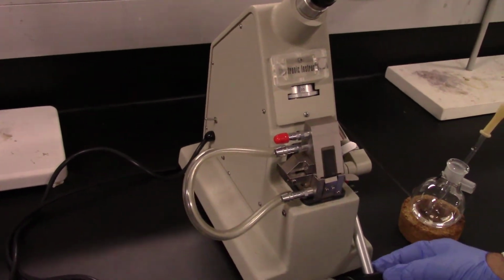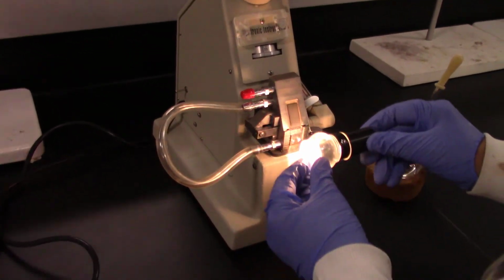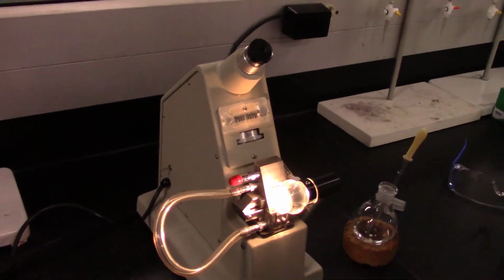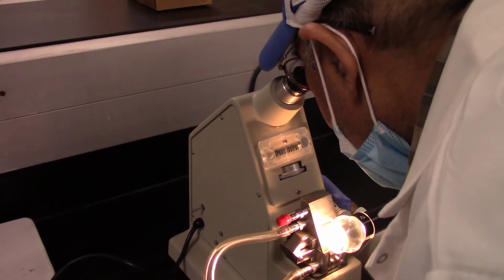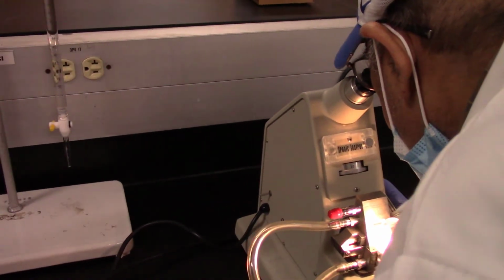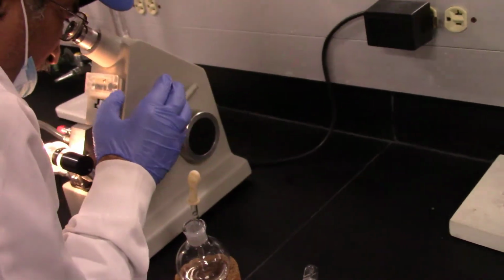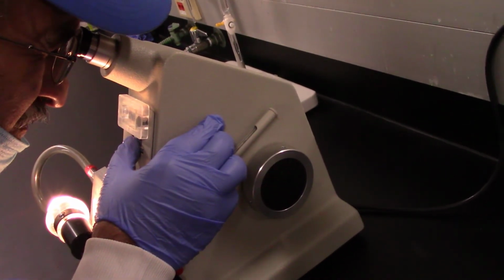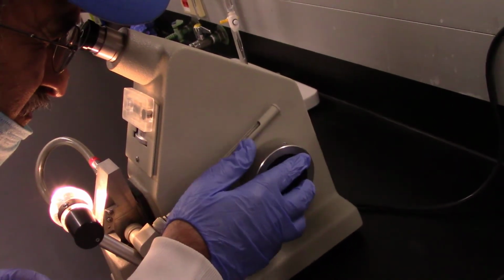Alright, and now you turn the light on, put the light up into the eyepiece. Through the eyepiece you can see the crosshairs, and you can also see a shadow that should be a black shadow. So basically this view should be just black and white. However, there are some rainbow colors, and you want to remove those colors by adjusting the fringes.